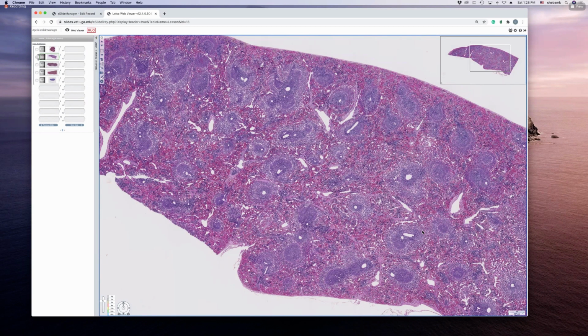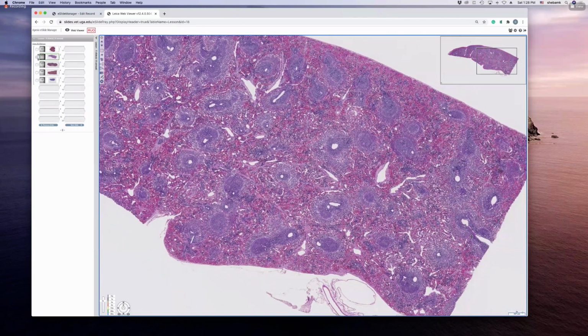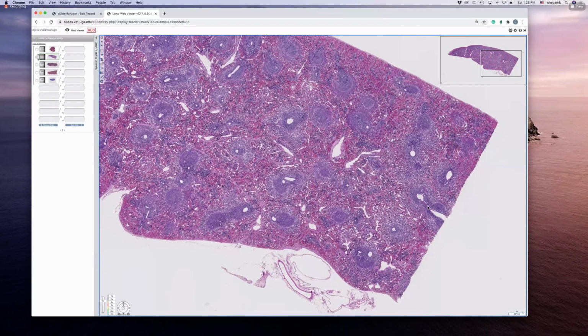I'll tell you, there is an artery in the name. Here is a good one. Here is a blood vessel coming in and it's covered by this. It's the artery of the white pulp. But what is this covering of lymphocytes called? The periarteriolar lymphatic sheath, or the PALS, is what we call them.